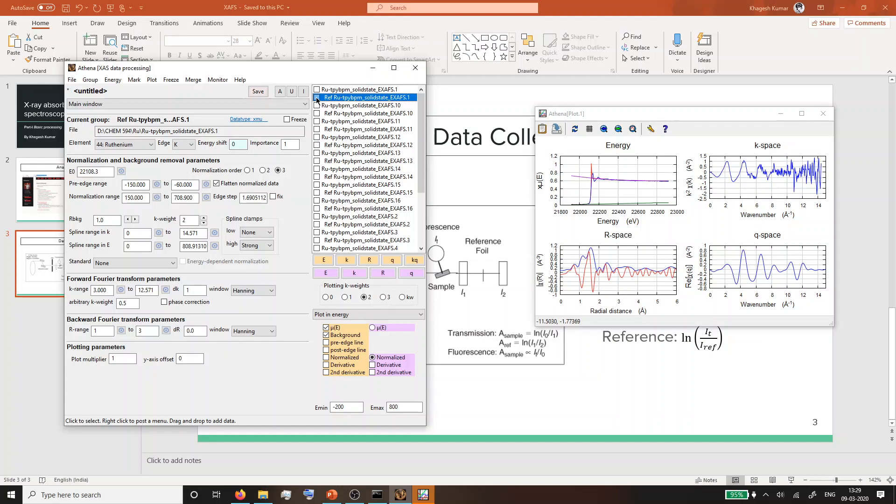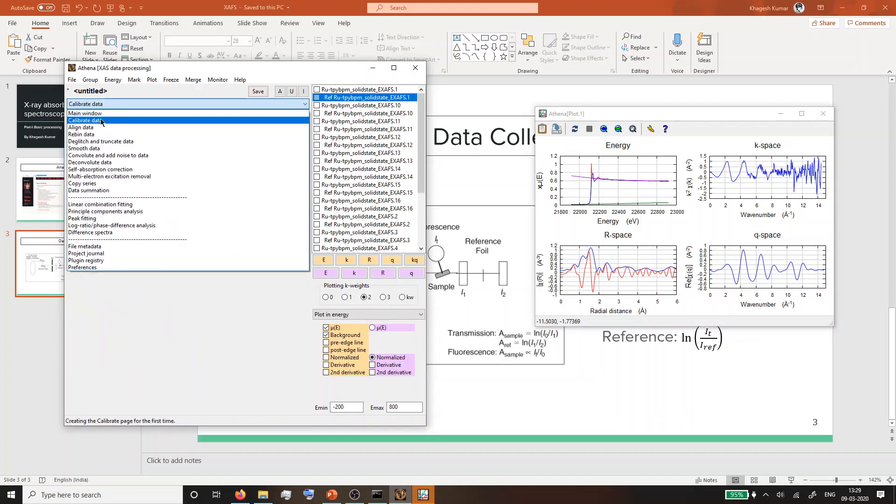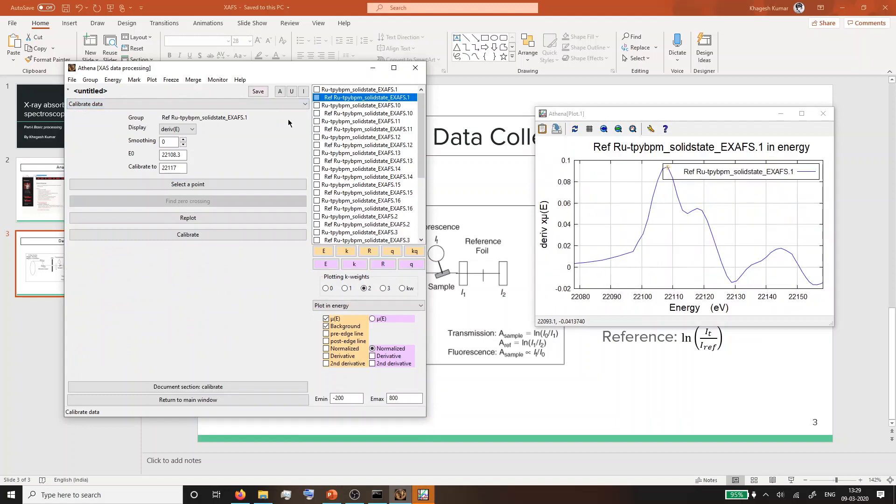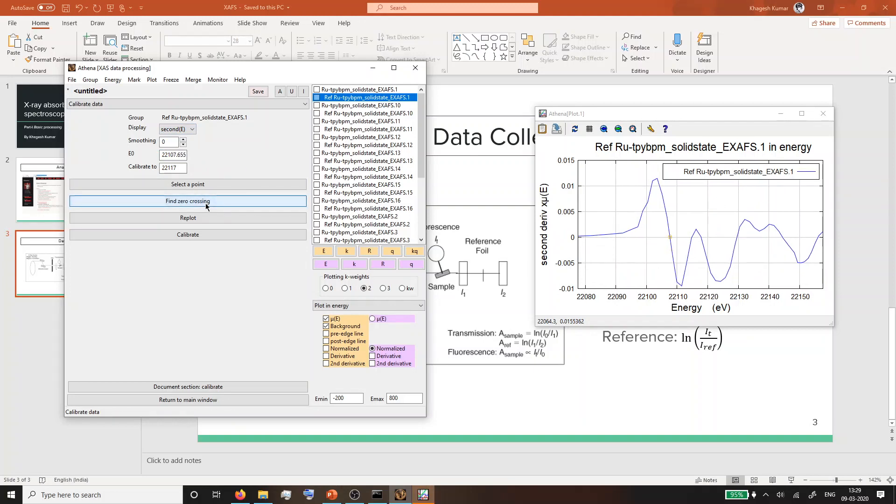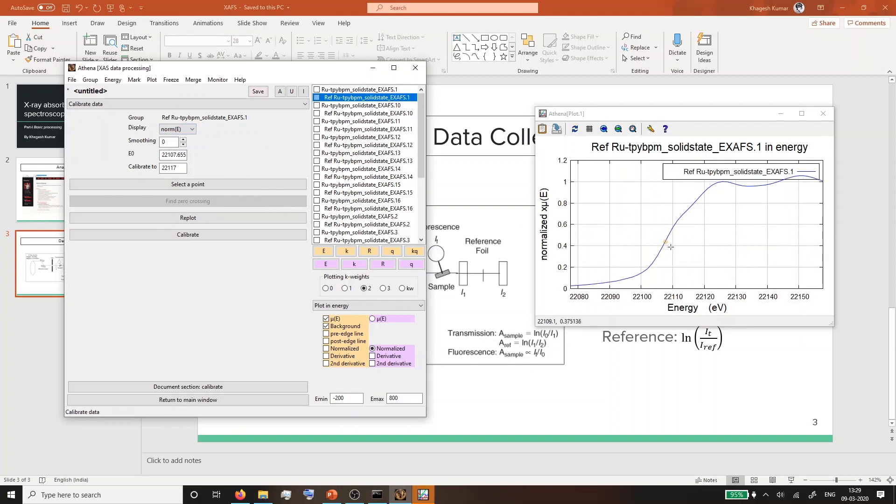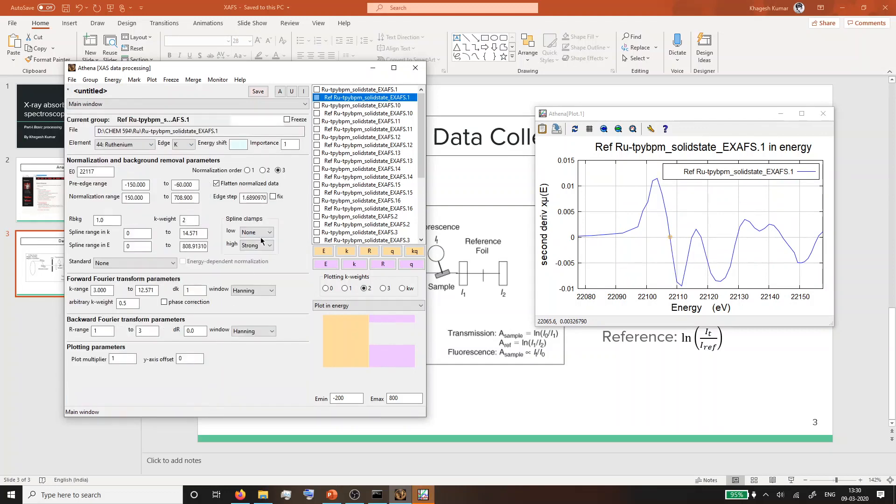Let's calibrate the energy first. Just below this drop-down menu you'll find calibrate data. Once you click on calibrate data, the plotting window will change. The best idea is to go to the second derivative of the plot and get the zero crossing - this is the inflection point. To verify, you can also check the normal spectrum. Ideally it should be somewhere on the rising edge. If you're satisfied that it's on the rising edge at the zero inflection point, you can calibrate.